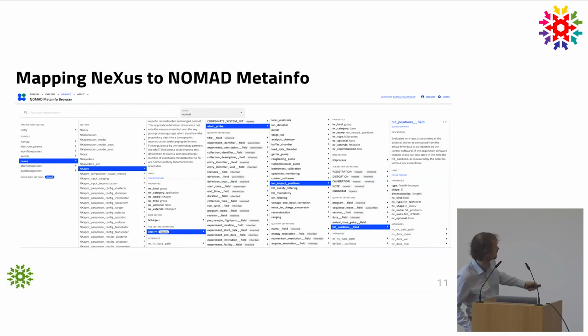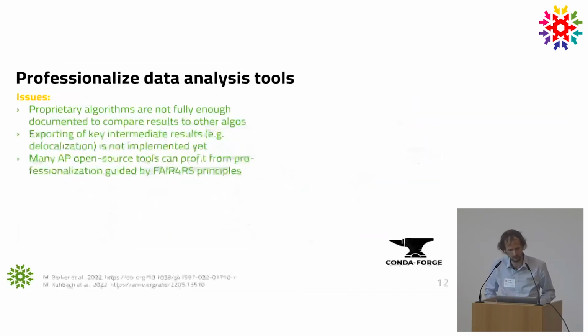And one of which I would like to highlight, that is this one, APM composition space results. That is exactly the application definition that we're now testing out with the people from Matwerk to use it in their software tool that they're developing in Düsseldorf to show that, in fact, at least one way of getting the data from the Düsseldorf and the Matwerk representation towards NOMAD works. And then we now work further on this project. We, of course, will also want to map back, but I'm going to, of course, only describe what we've done.